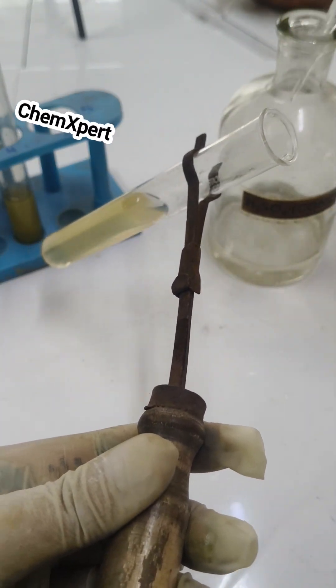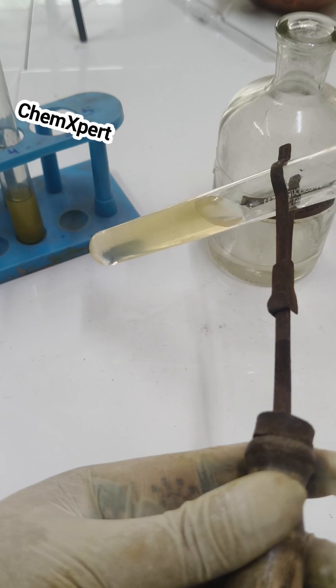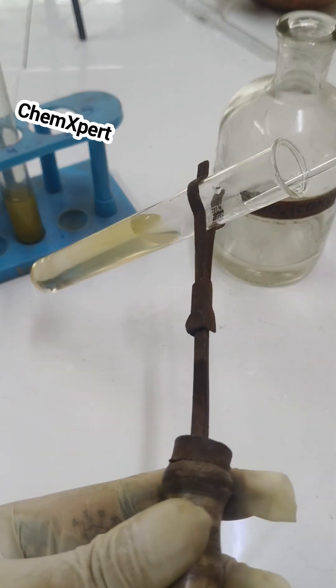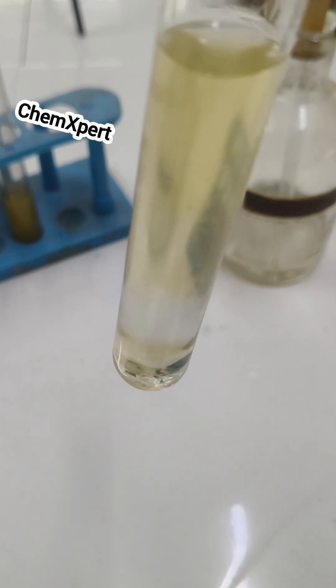Place the test tube at the angle of 45 degrees and at the side of the test tube add concentrated H2SO4 into it. You can observe a ring is formed at the junction of two liquids.